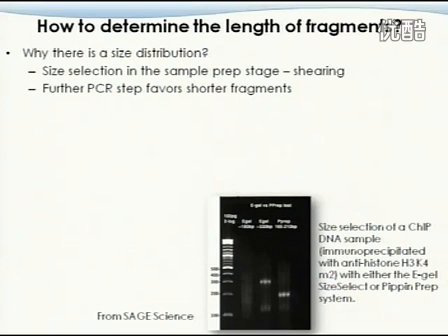You have the ChIP-seq. The first step, you do the cross-linking, and then you break the DNA into smaller pieces. Then you use an antibody to target that protein. Now you have that DNA sequence, which is a couple of hundred base pairs long, and then you only sequence the beginning of it. So this is for that couple-hundred-base-pair-long DNA fragment, and this is size specific, so we can control the size of it.